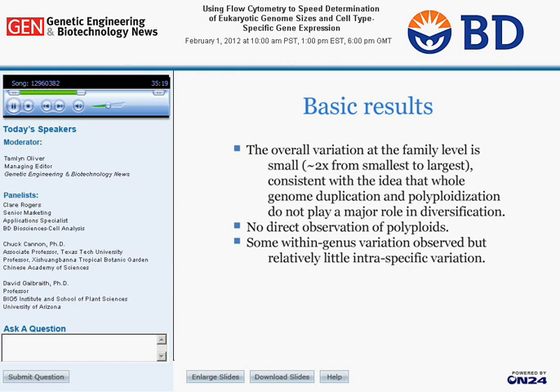So when you're measuring numerous individuals of one species, they all pretty much have the same genome size. And that's, again, a testament to the accuracy of the machine and how you can use it very effectively. You get the same reading from the same species most of the time. But still, there is some variation existing within the genus. So the different species within one genus do have slightly different genome sizes, up to about 20-25%.